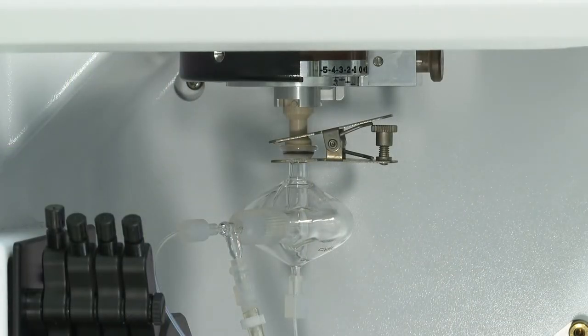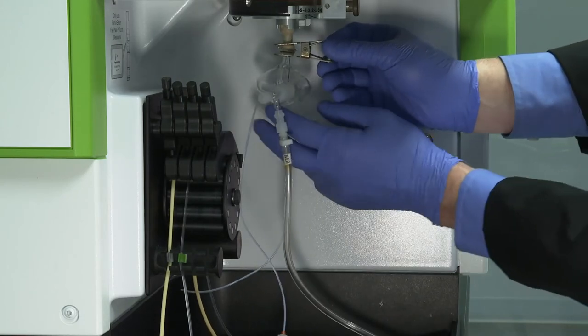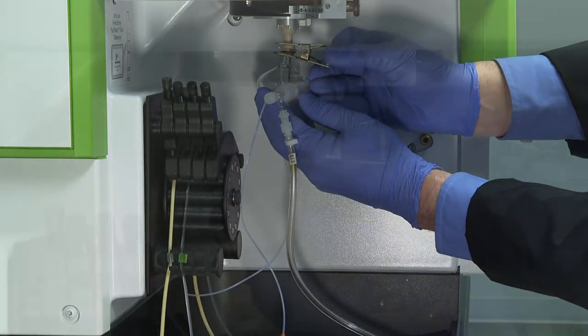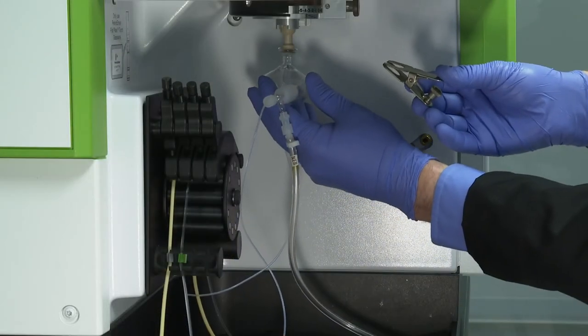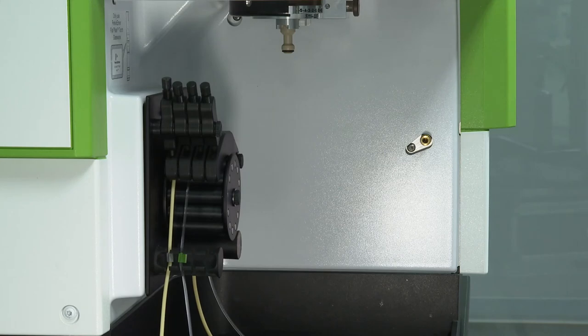If a cyclonic spray chamber is installed, loosen the tension screw on the spring clip securing the cyclonic spray chamber to the injector support adapter. While supporting the cyclonic chamber with one hand, remove the spring clip with your other hand, and then separate the cyclonic spray chamber from the injector support adapter and place it aside.